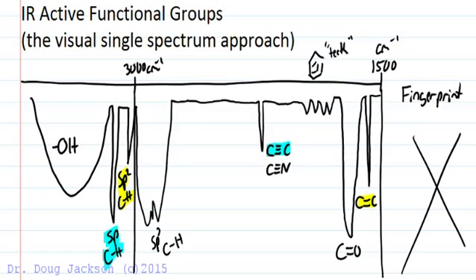In this region where the C=C double bond exists, we can have a shorter version of that, which is the NH bend. This is a scissoring bending action away from or toward the lone pair. This is just a bend back and forth, NH bend. It looks like a shorter, wider version of the C=O double bond. And so this occurs for primary amines and amides. This is very prevalent for primary amines and amides for structures like that. So they might show up there.